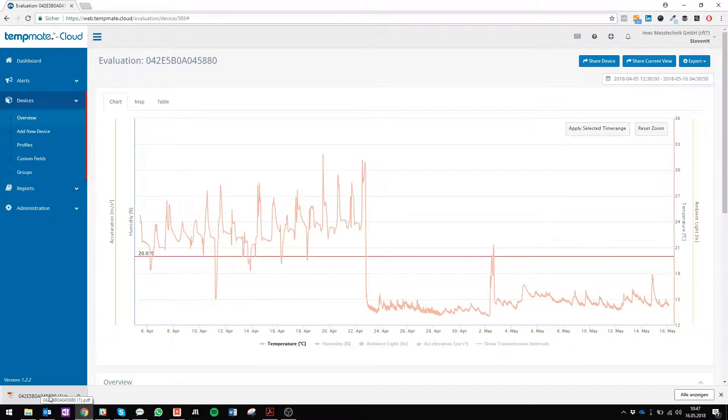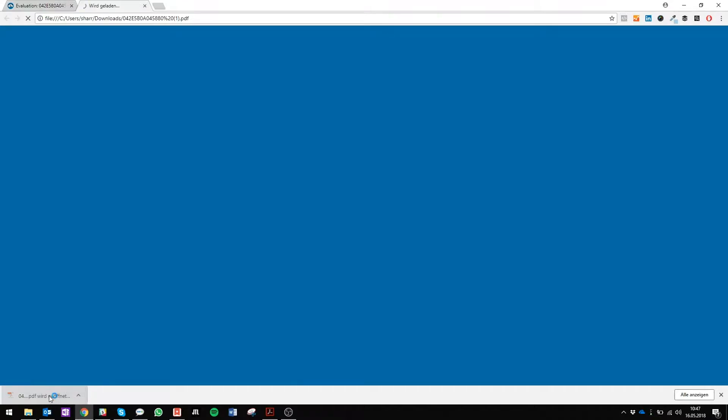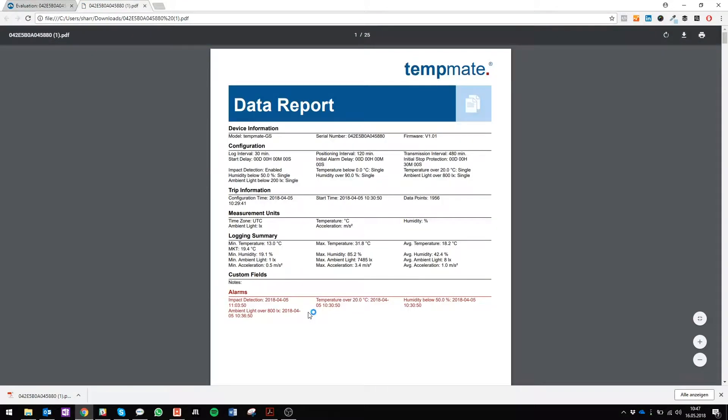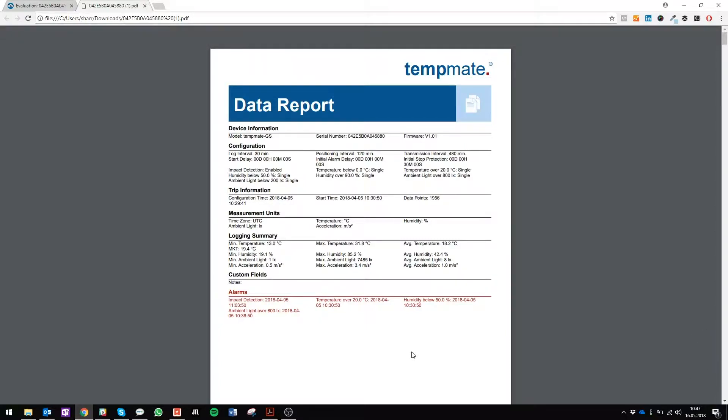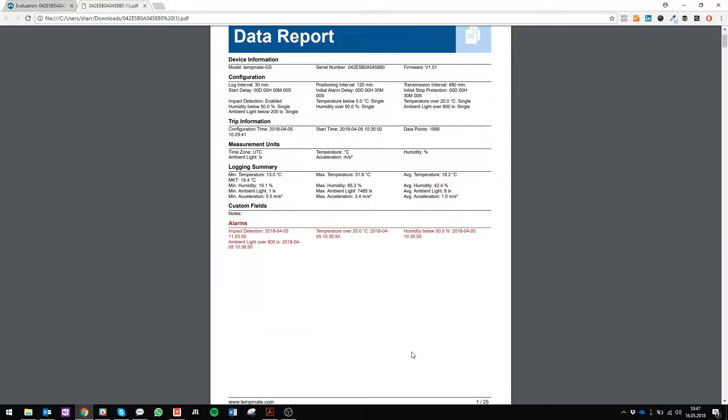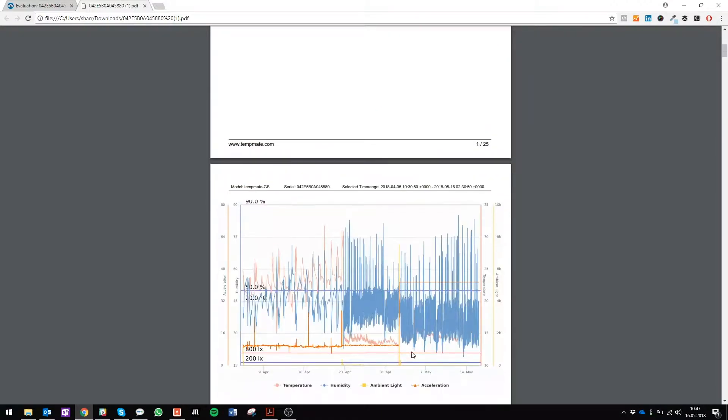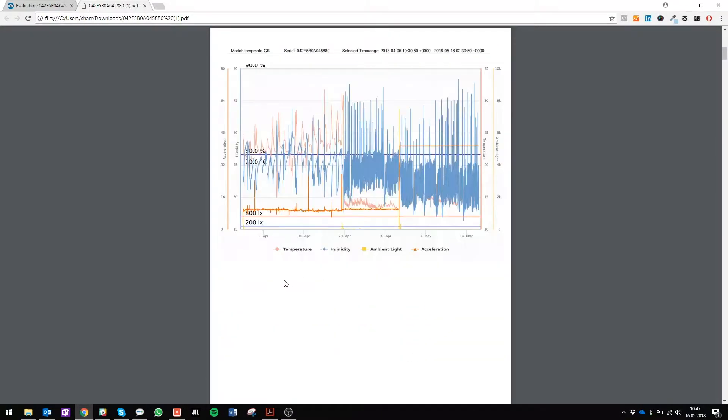If you want to analyze your data in PDF format, just click on it and it will open right away. Here you have all your necessary information of your device and your log data. You can scroll down and you will see all information that has ever been recorded.